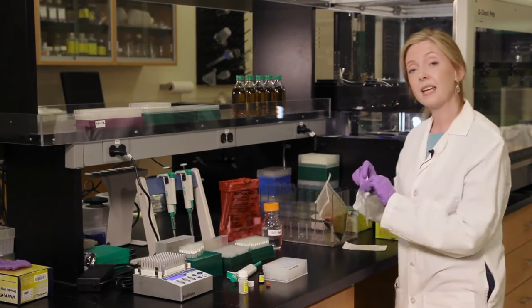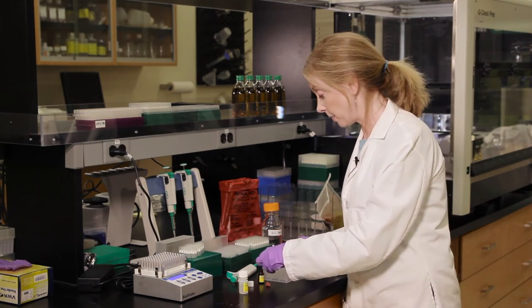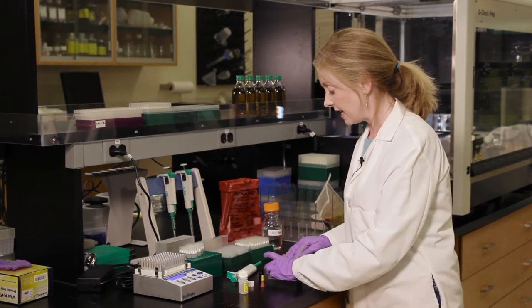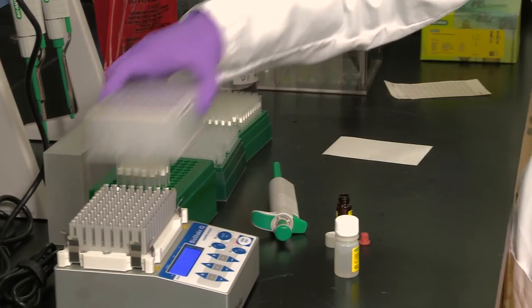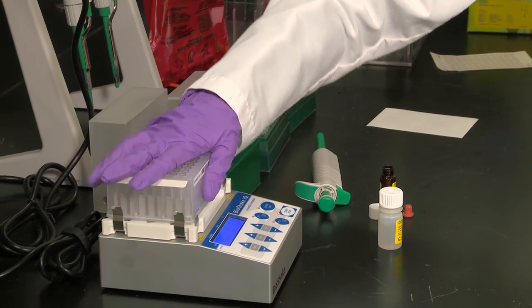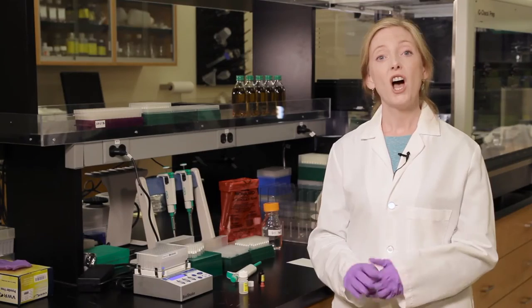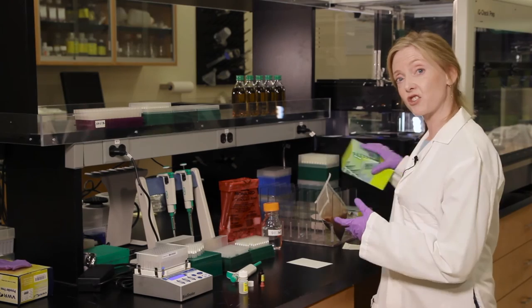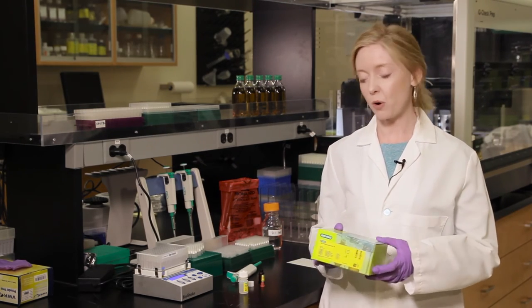We're ready to incubate. Take your pre-pierced film and add it to the top of the plate, using the shiny side to remove any air bubbles that might be present. Put that onto your heater for 15 to 30 minutes with no agitation. After 15 to 30 minutes, proceed to the IQCheck Easy DNA Extraction Protocol — check out our video on our YouTube channel for a more detailed look.